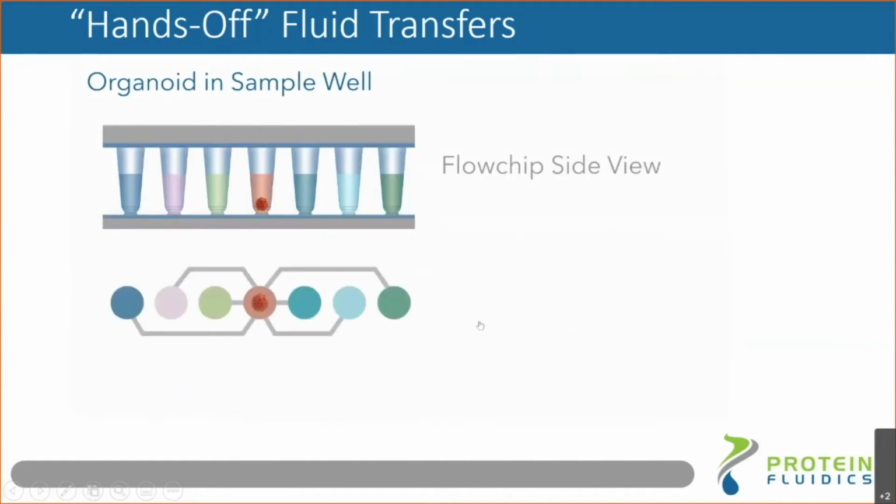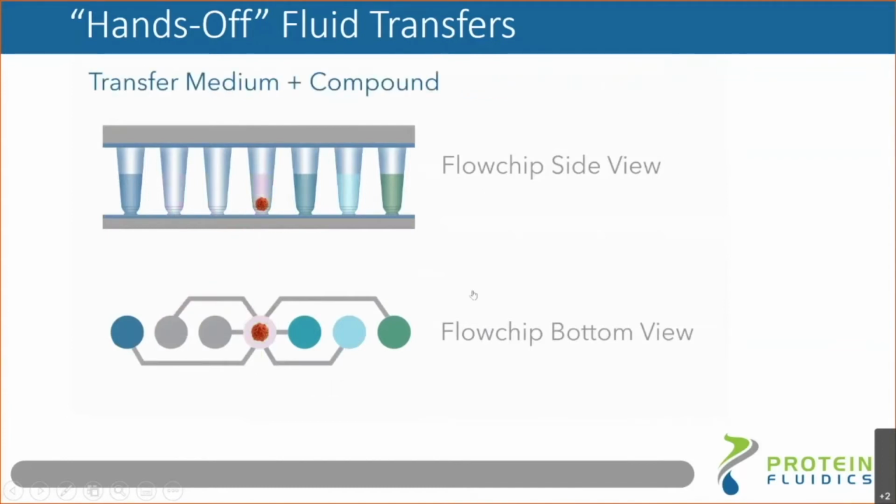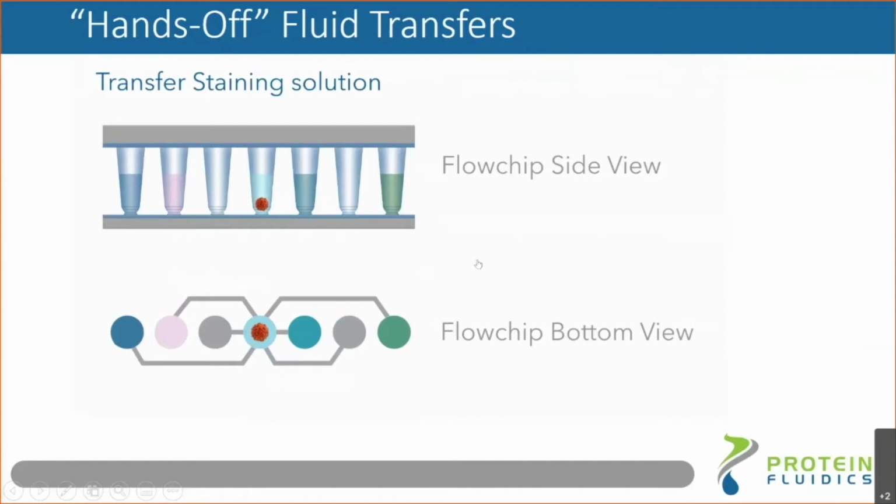As this runs again, we show the media transfers occurring. And then after the transfers are done, you now can prepare it for downstream analysis, where you then, for example, move in a staining solution. The staining solution can then sit in the well for a predetermined amount of time. You can remove the sample plate at this point to do imaging. If the stain produces higher backgrounds and you wanted to do that, you could drain the staining solution and move in a wash buffer.